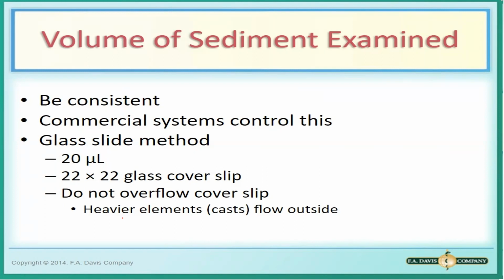Sa cover slip po, it is best na gumamit kayo ng cover slip para yung view ninyo is iisa lang. Kapag kasi wala kayong cover slip, minsan nagpapatong-patong yung cells. Kapag may cover slip ka, maiiwasan yung patong-patong na cells.